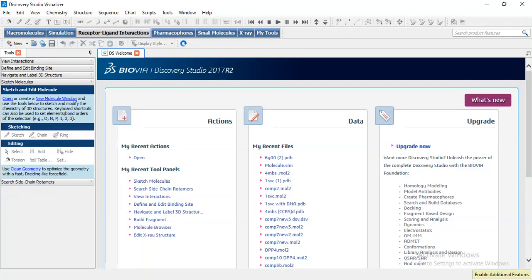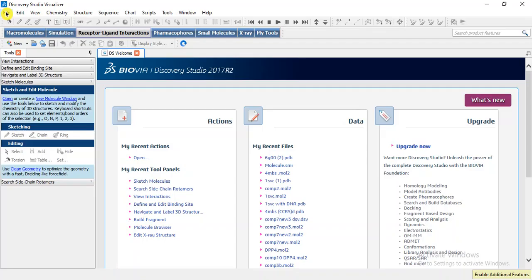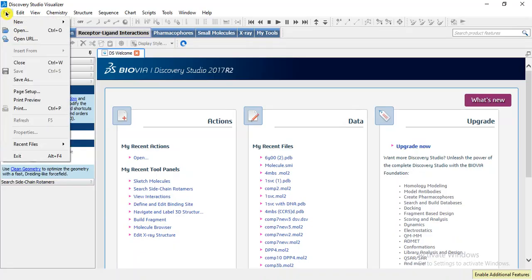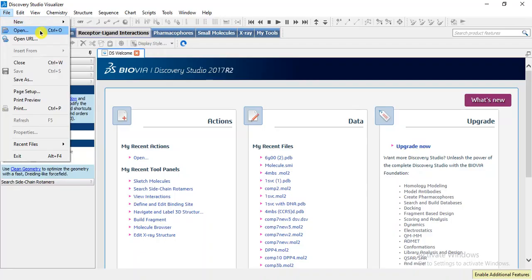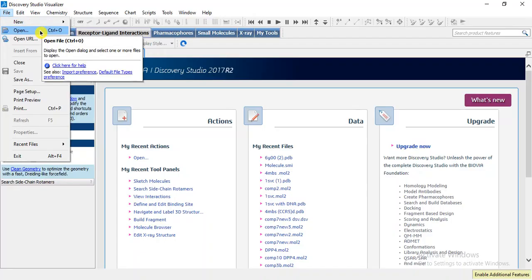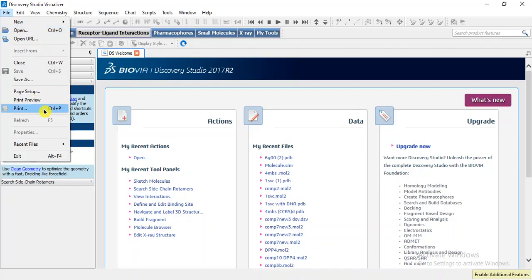In our previous lectures we studied how we can retrieve macro and micro molecules. Today we will discuss how we can observe ligand target interaction. In the file menu we can select a new molecular window or we can open a file we have already saved in PDB or mol2 format.